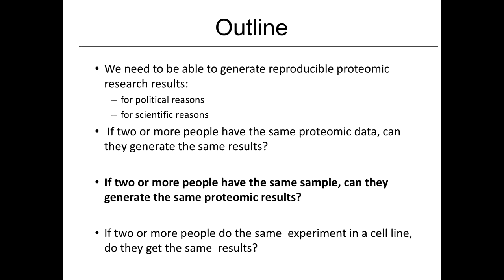So this is at the level of data processing and analysis. This DIA technique, thanks to this community effort, which is actually admirable, that everyone got together and was willing to admit that maybe their tool needs improvement here and there. And it's not the question who is the best, but do they achieve something which is helping the community to generate reproducible research results, and this goal has been substantially advanced.